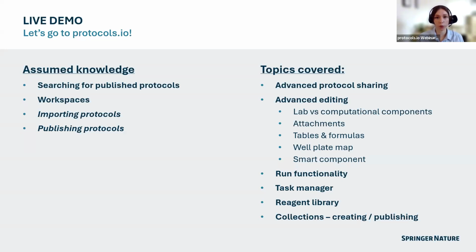I will very briefly touch on importing and publishing as they're key aspects of protocols.io. But the core content that we will cover is listed here. All right, so I'll stop sharing the slides now and then reshare on protocols.io.